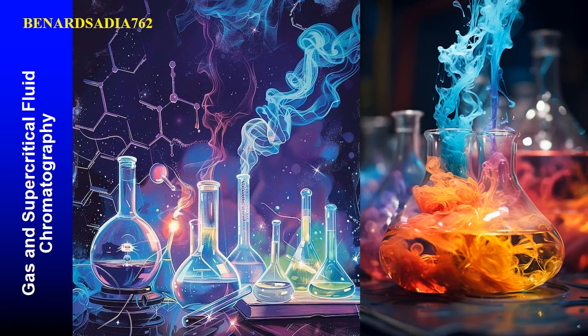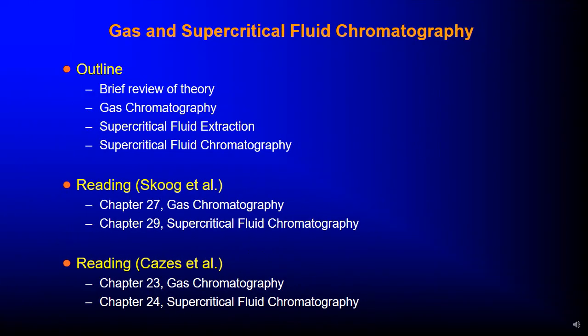Today we want to discuss gas chromatography and supercritical fluid chromatography. Welcome. Generally the outline is a brief review of theory, gas chromatography, then we look at supercritical fluid extraction and supercritical fluid chromatography.